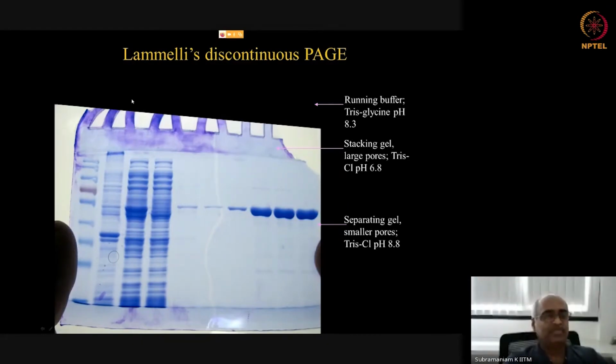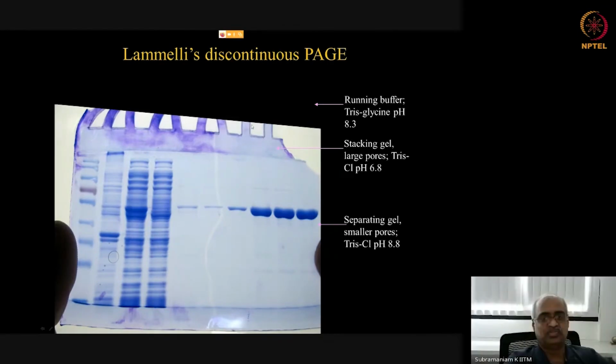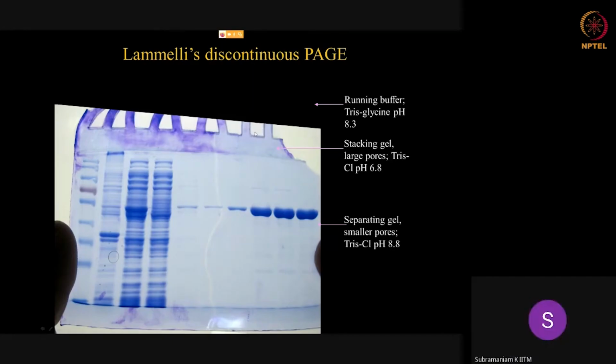So this is going to be a long comb-like structure. So you can see here, it extends some more. It's usually about a 1 to 2 centimeter depth well. So now when you add liquid, let us take this one, this is a uniform shape. Suppose the liquid fills this much, and when it is homogeneous, the same protein molecule will be present here, here, here, everywhere up to the top. So you have a column whose height is about 1 centimeter, let us say.